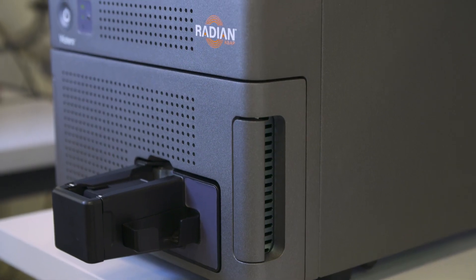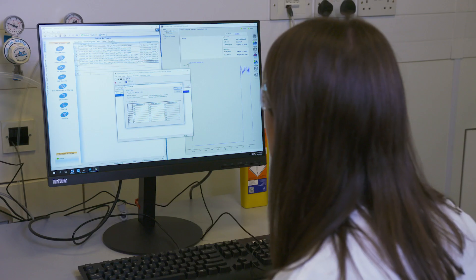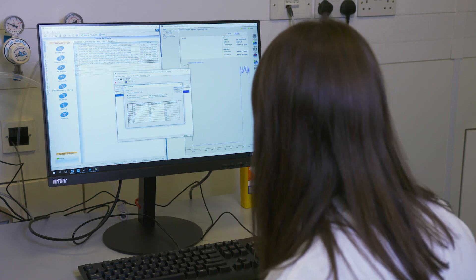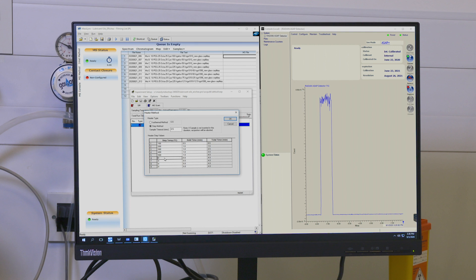However, when dealing with highly complex samples, some degree of separation is beneficial. RADIAN ASAP offers features such as the ability to apply a thermal gradient temperature ramp that separates components based on their different boiling points.